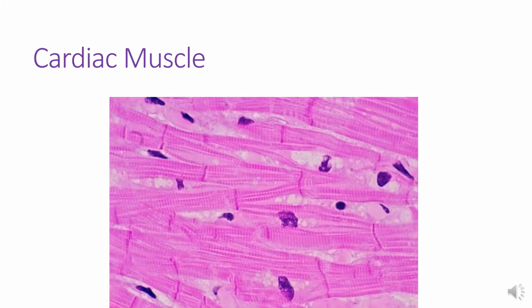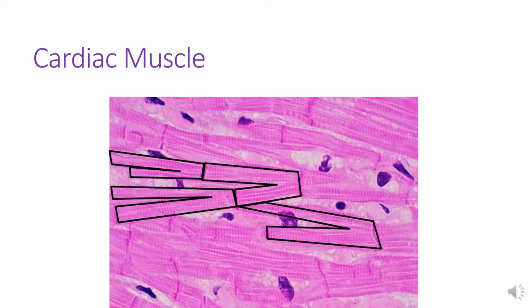Let's contrast that with another kind of striated muscle, that is, cardiac muscle. I follow the same series of steps. First, I need to find cells, so I'm going to highlight several cells here. I could find those cells because of a special feature for this type of tissue that we'll name here in a little bit. And what I find are cells that do touch each other, so they are packed pretty close together, but the cells don't line up in a nice neat row. Instead, the cells kind of branch and go off in different directions. So I might be looking at some kind of muscle.